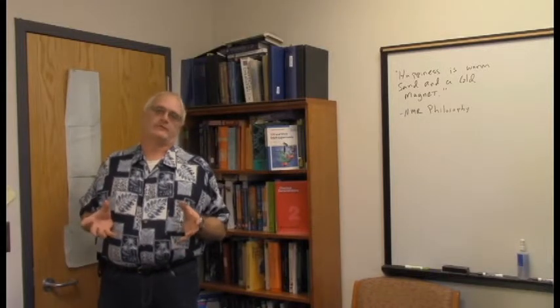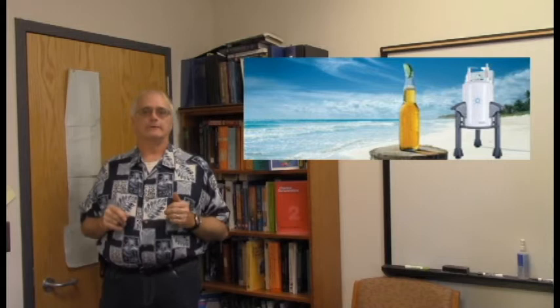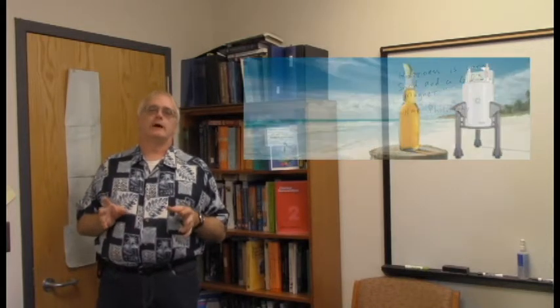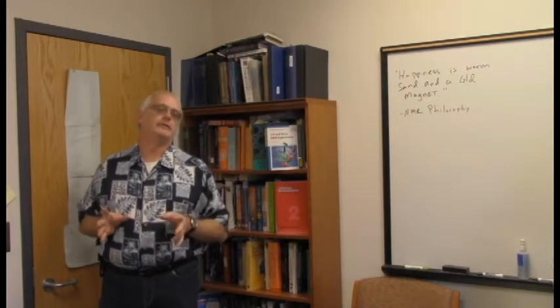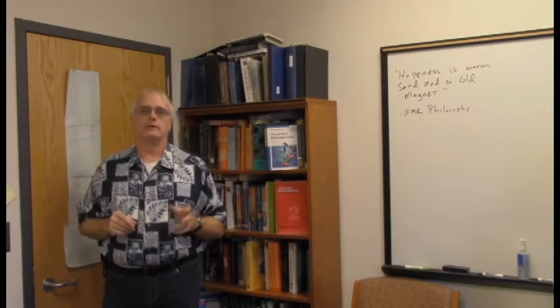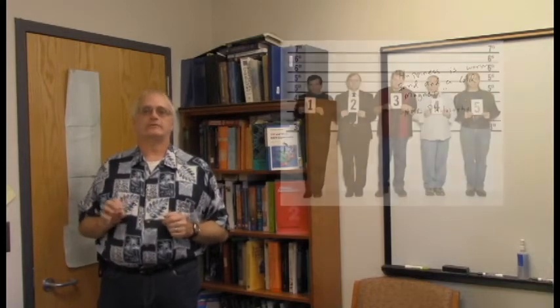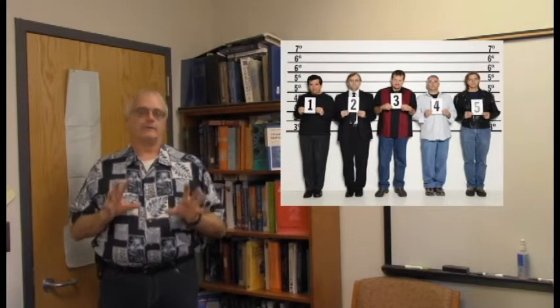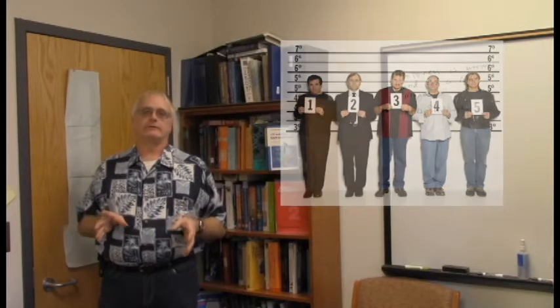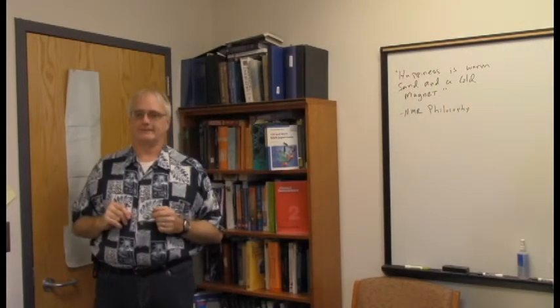I was thinking about some of my favorite things the other day, and yes, it included NMR spectroscopy. And I was thinking in particular about one of the most common types of questions that chemistry students are going to encounter when they start learning NMR spectroscopy, and that is the old pick the structure out of the lineup problem. We'll give you a spectrum, we'll give you a series of possible structures that would match that spectrum, and your job is to figure out which one it is.